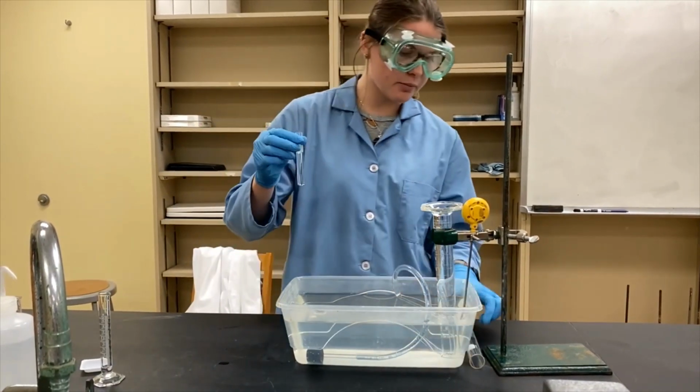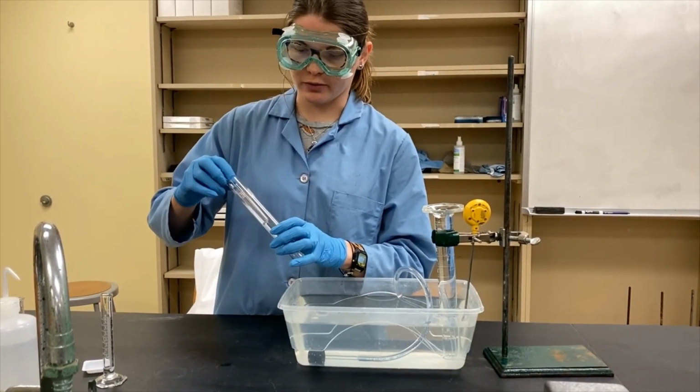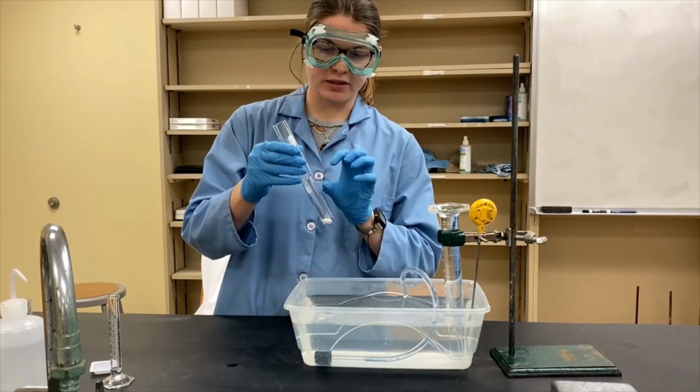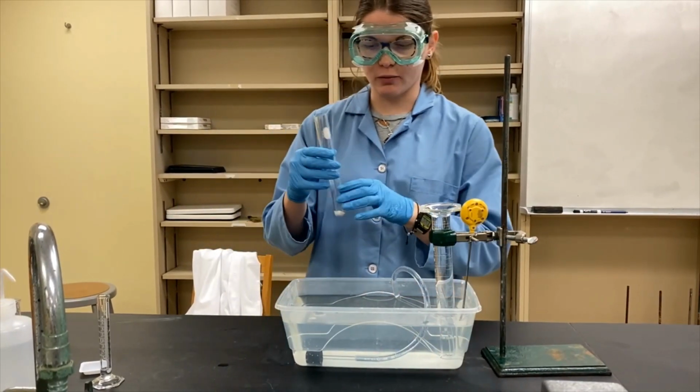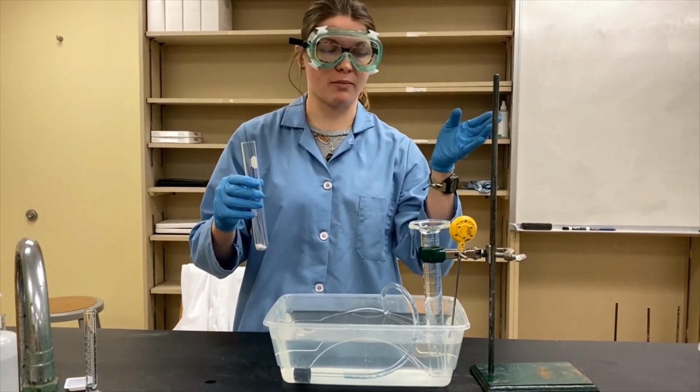And I don't need all 10 milliliters, like I said, we just have it in excess so that we know that it will react with every amount. So I'm going to slide this gently down so that it doesn't splash out and start reacting. We don't want to have the reaction yet because if gas is formed, it's going to go into the atmosphere and we can't measure it.